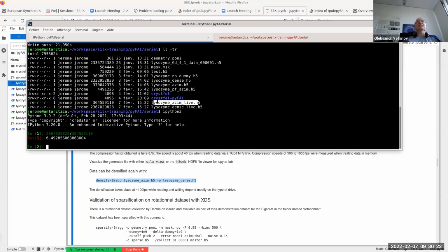Thank you. And actually two more questions. To process this data, you have to uncompress it, right? For now, you're perfectly right. In order to be able to validate the complete chain, we have a compressor and a decompressor, and we even regenerate some noise on the data to have something that looks like the noise you would have.